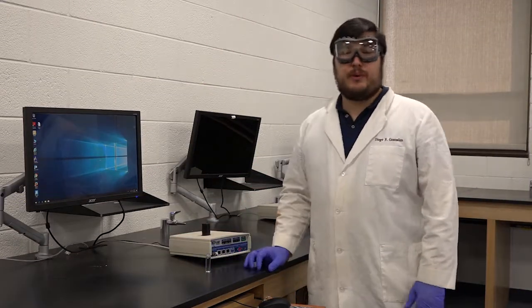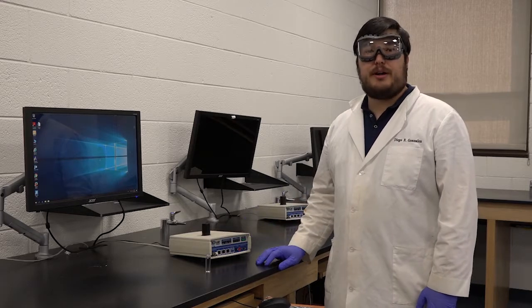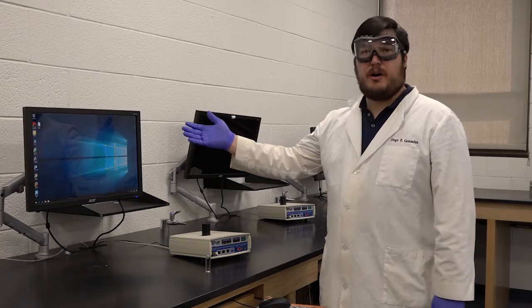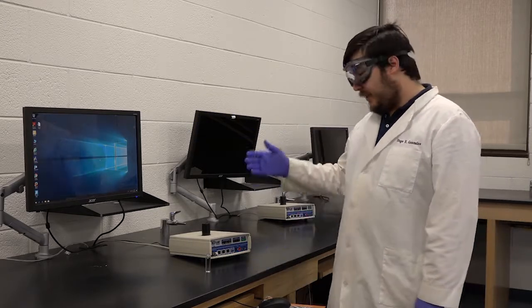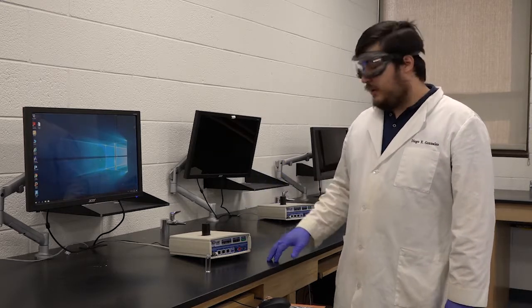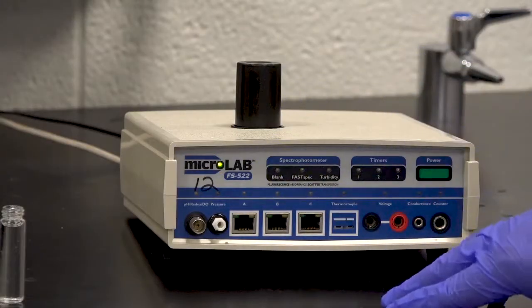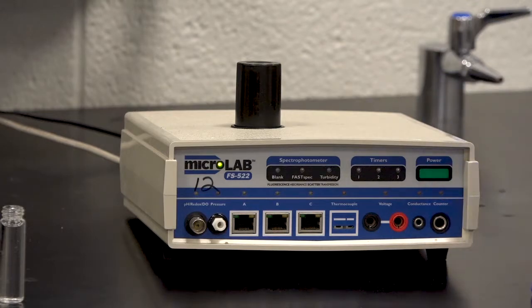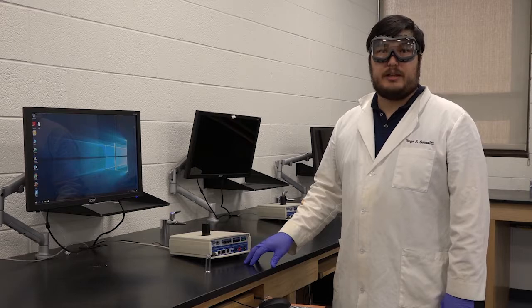To begin the blank, we first need to make sure that the computer and the spectrophotometer are on and functional. For the computer, it's quite simple. Just check to see if your monitor is on and if the computer is on. You should see your desktop. From there, make sure that the microlab instrument is also functional and on. To do this, check to see if the microlab LED is illuminated. If not, press the green power button on the right-hand side of the microlab instrument and wait for the microlab to initiate and to illuminate the LED.